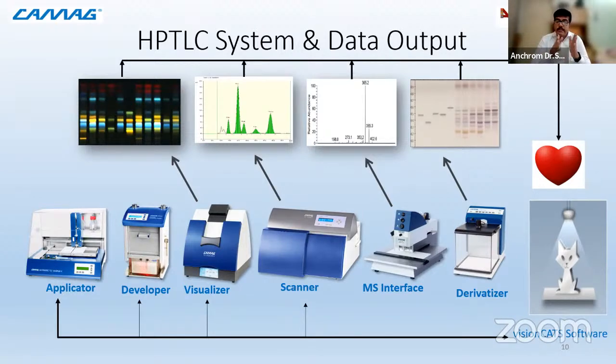That is controlled with the help of this ADC2, which conditions the plate surface with a blast of conditioned air. This air has a 33% moisture level. The moment it touches the surface, it removes the excess moisture, absorbs it, and leaves. Again, there is a chamber inside where it deposits the excess moisture and returns to the plate at 33% again. This is achieved when we circulate the air over a saturated salt solution, with one end at the plate and one end at the salt solution. The air comes, picks up the moisture, goes into the salt solution, deposits the excess moisture, and comes back. The salt generally used is magnesium chloride hexahydrate, from which we prepare a saturated salt solution.